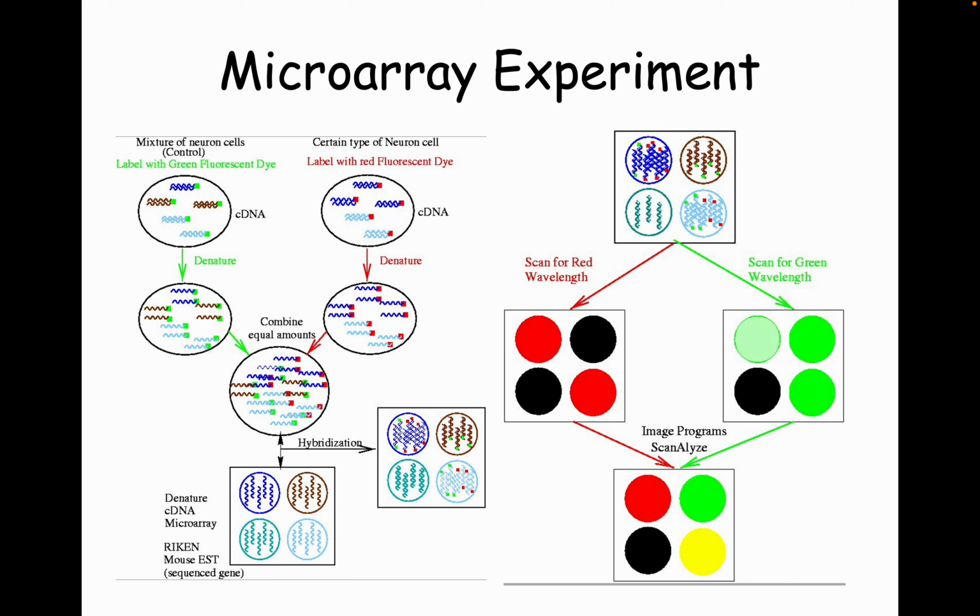You can make your own array and you can interpret the array. You can build your own program. And then, hey, you can sell it to somebody else or make it free on the internet for someone to use. So yeah, you can scan for different colors separately. You can scan for all the colors together.